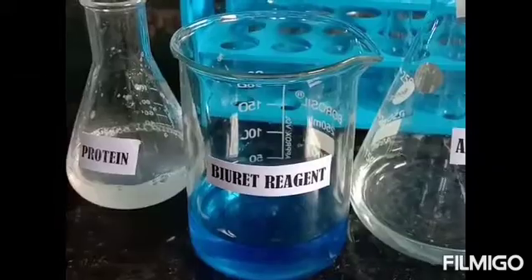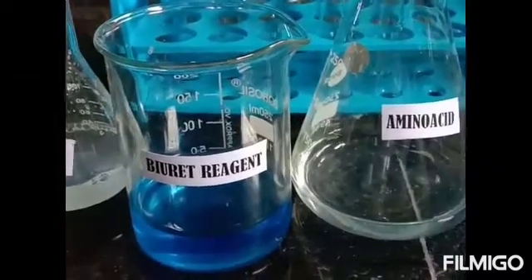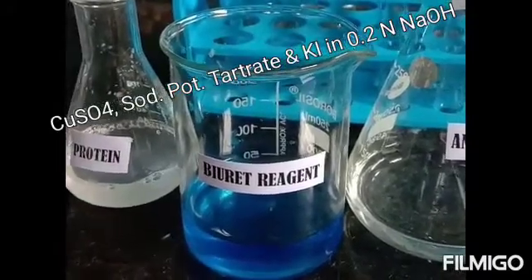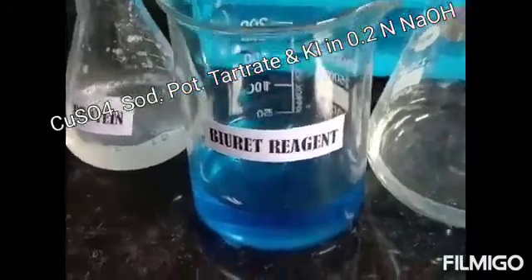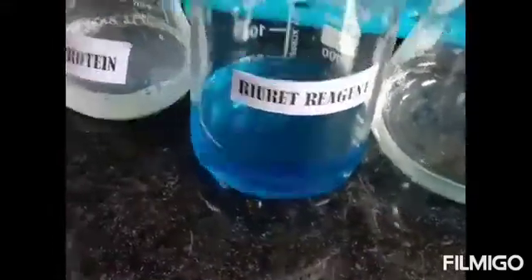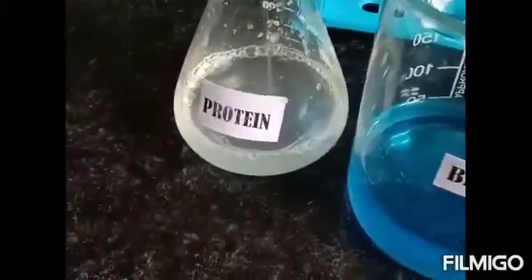Biuret test for proteins. This is Biuret reagent. It is prepared using 3 gram copper sulfate and 9 gram sodium potassium tartrate dissolved in 100 ml of 0.2 normal NaOH, to which 5 gram of potassium iodide is added and made up to 1000 ml using 0.2 normal NaOH.